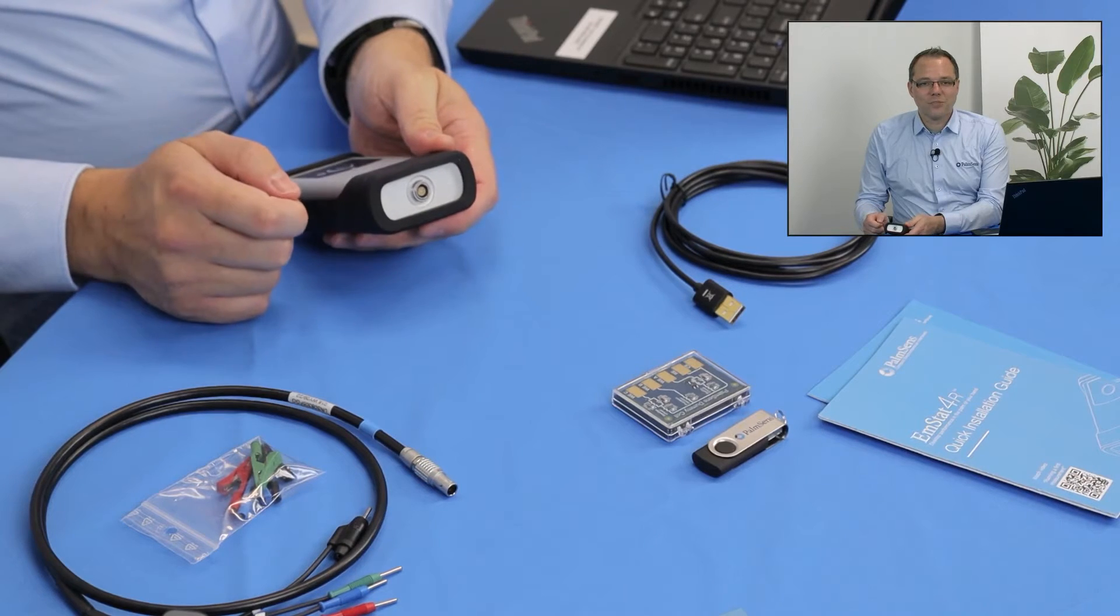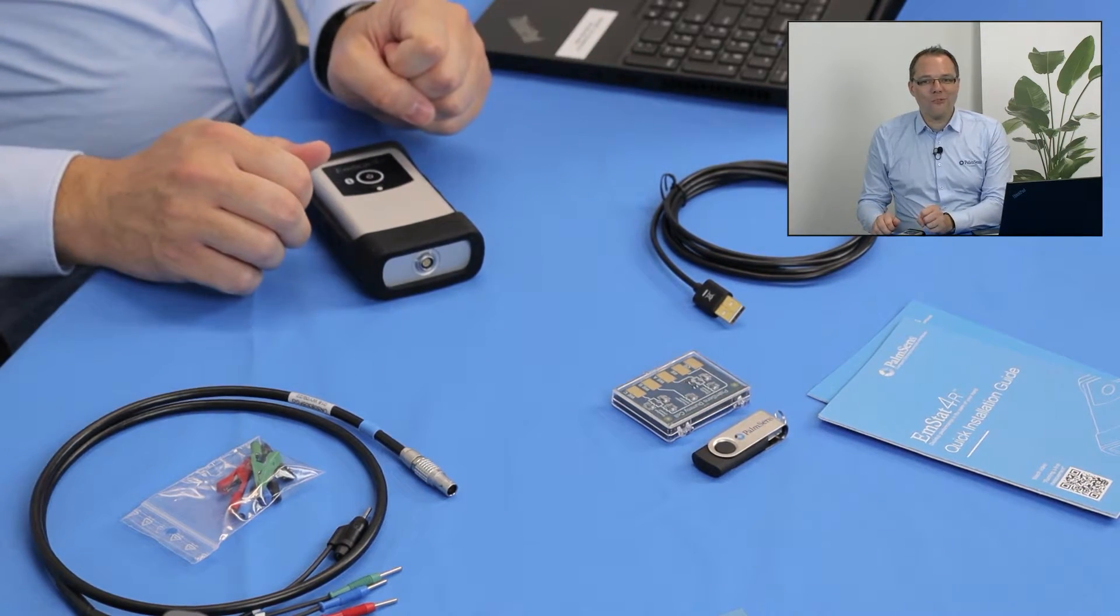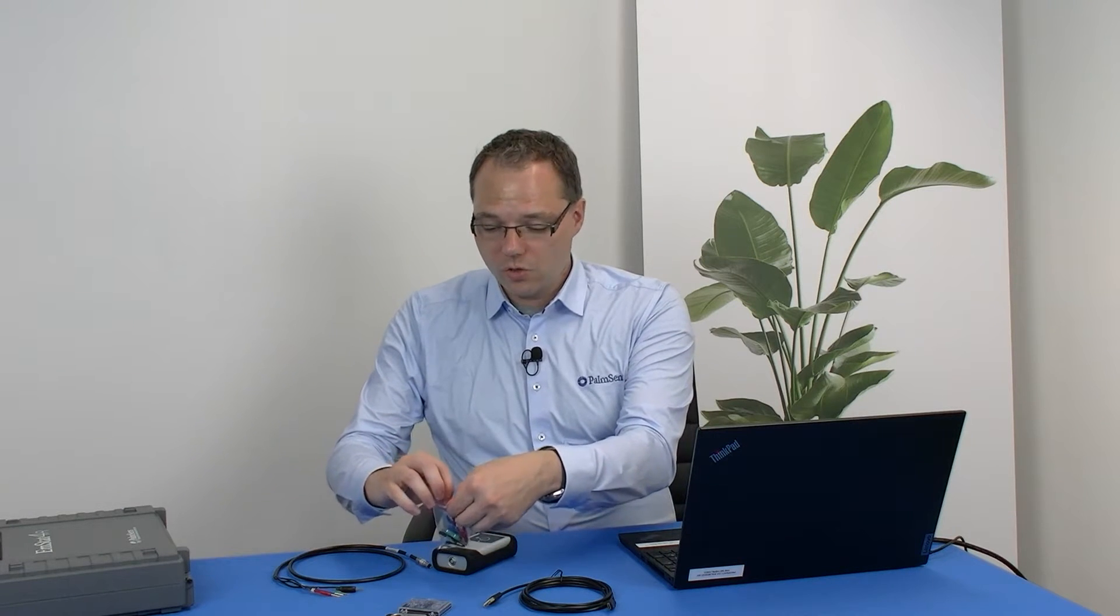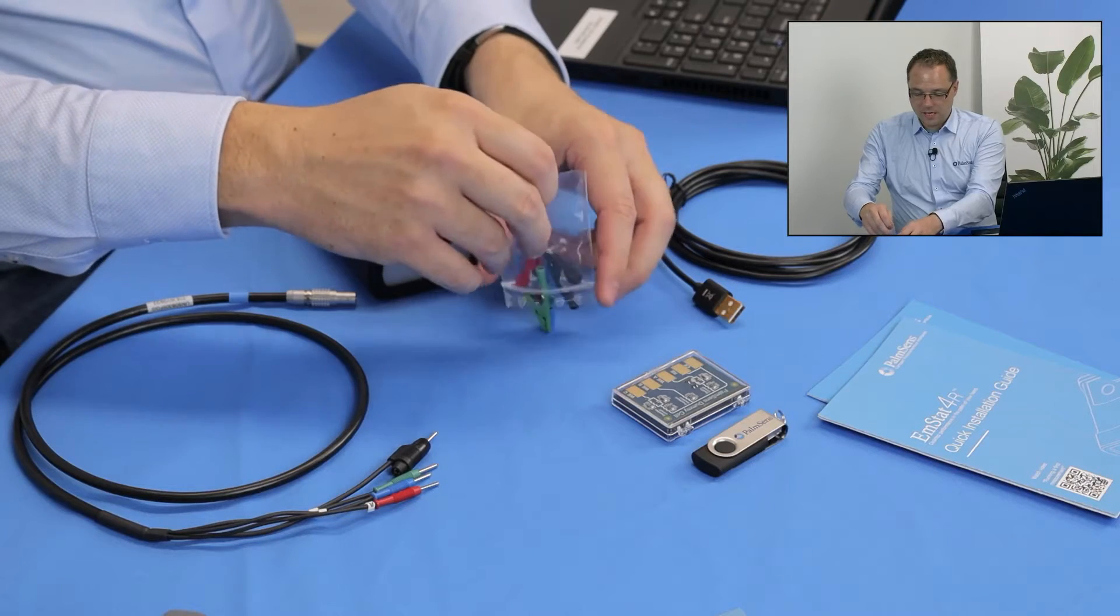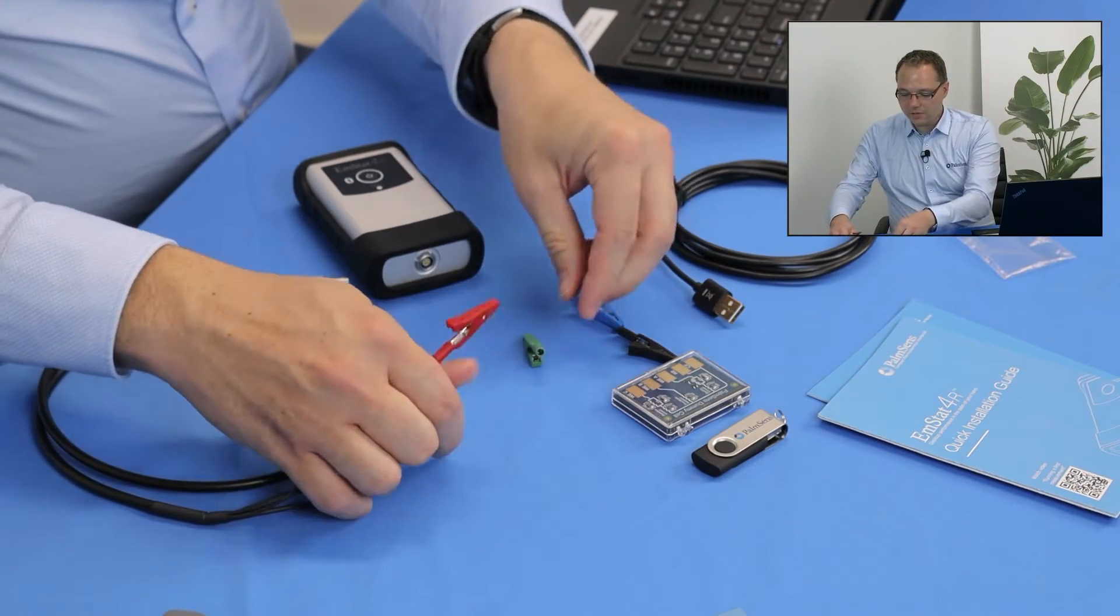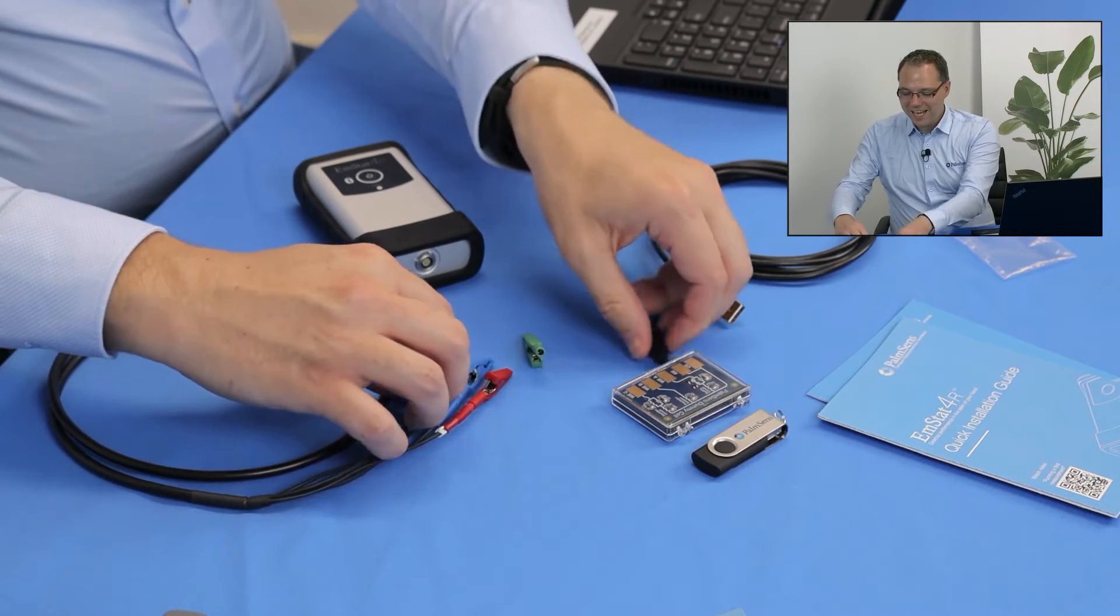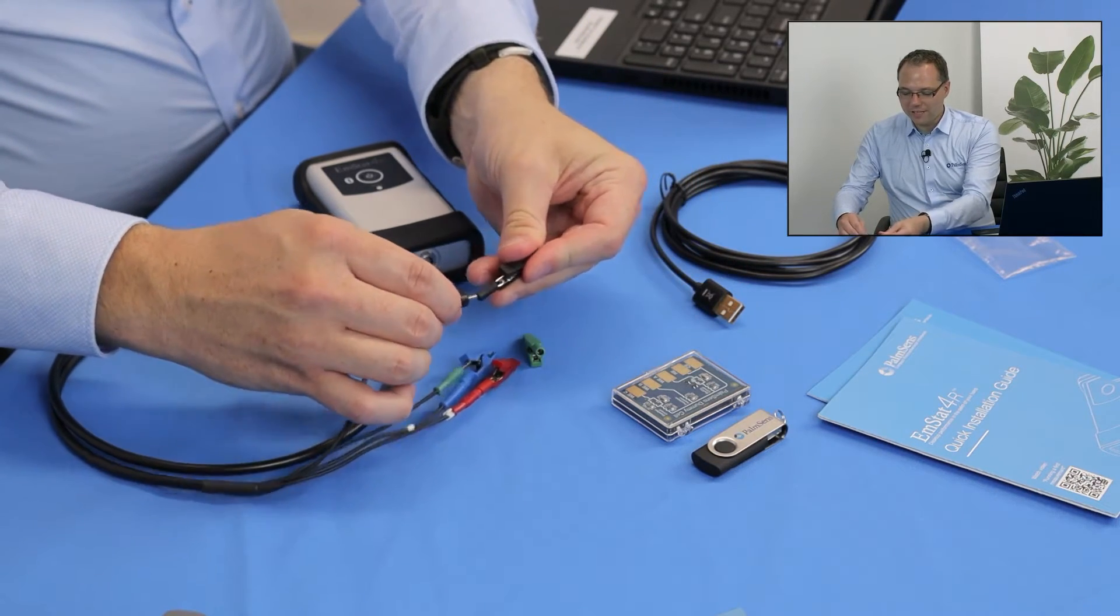That is an alternative, as I said, but today we're going to use the connection for the cable. So I think it's time that we set up our first experiment. I start by connecting the crocodile clips to the banana plugs. I connect the red clip for the working electrode, the blue clip for the reference electrode and the black clip for the counter electrode.